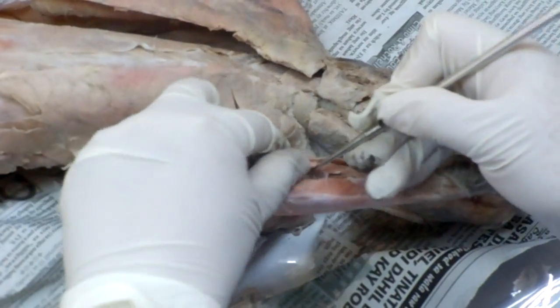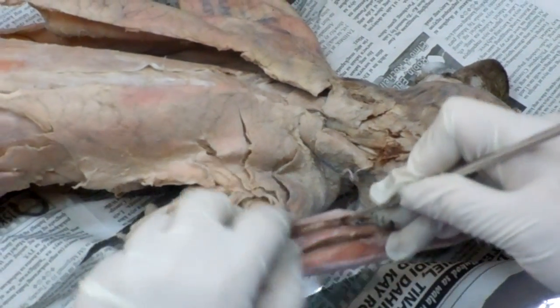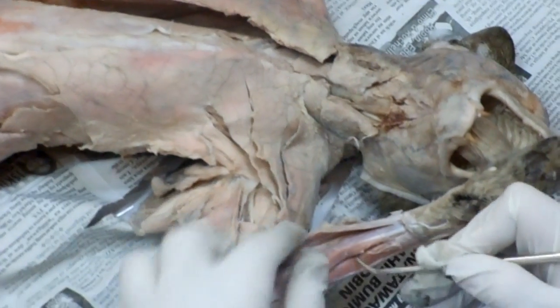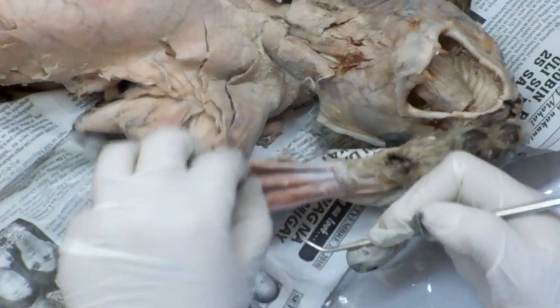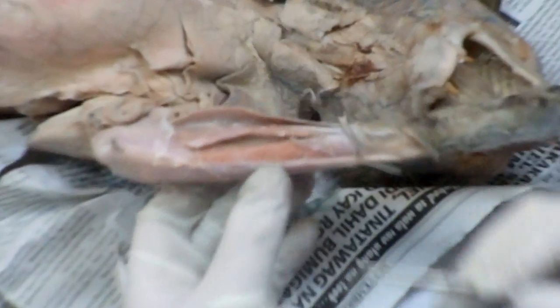Sa'yo camera. Lahat. Yung hinawi ko, itong ilalim na ito. Ito. So, flexor, ilalim siya nito, partly covered by the palmaris. Flexor profundus digitorum.